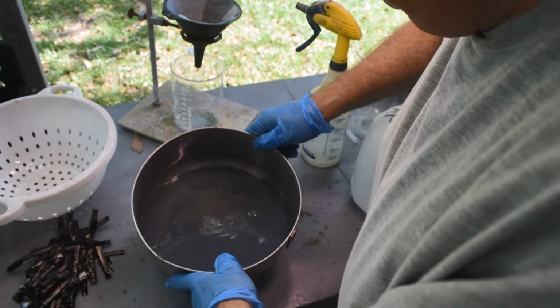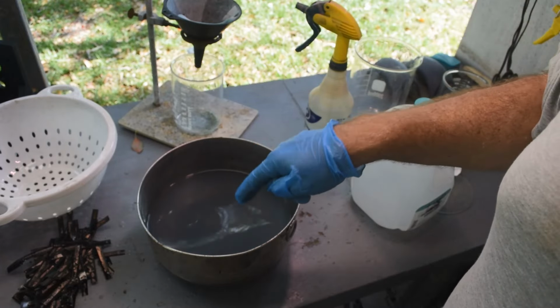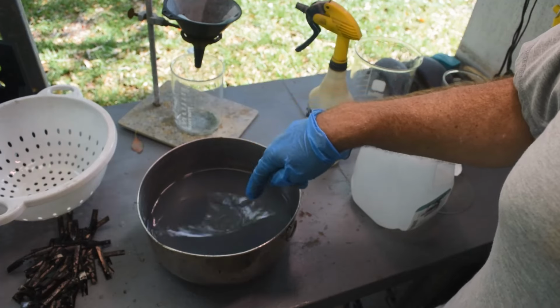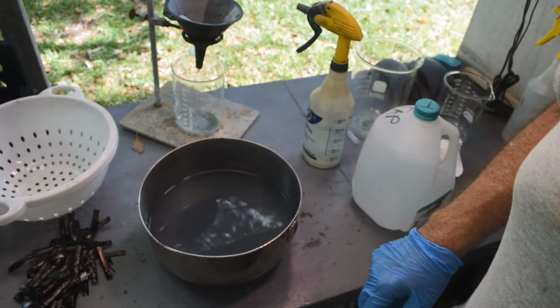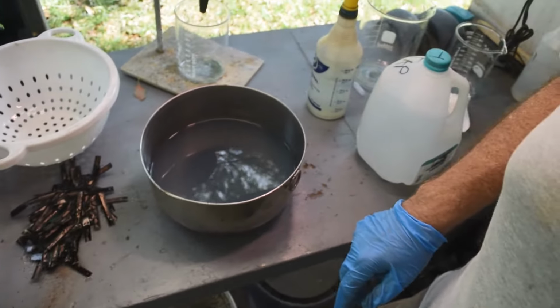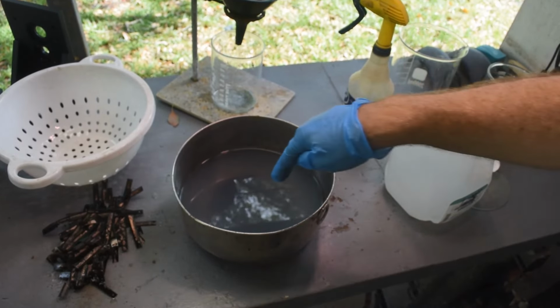And there's a lot of stuff down the bottom of the bowl. I'm going to do the same thing I did with the other stuff. I'm going to pour this liquid off through a filter. We're going to catch all those little bits, and we'll have two filters containing pretty much all of the palladium from 100 grams of this material you sent me. So let me clean up my mess a little bit and get set up, and we'll filter this stuff.